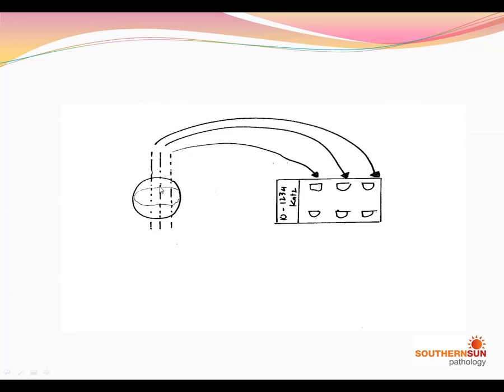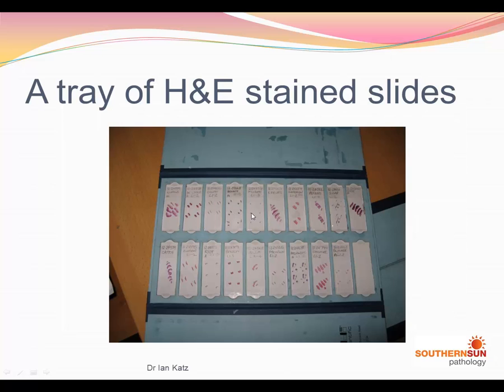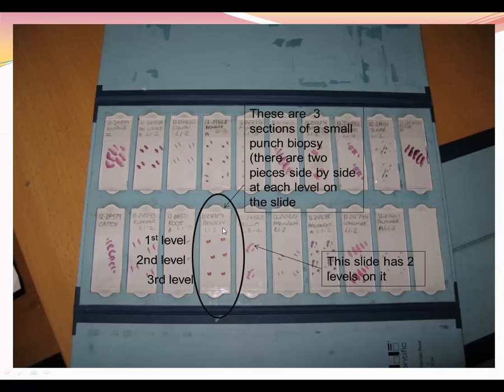This is what a tray of slides looks like once they've been prepared and stained. In this wider example, you can see these are three sections of a punch biopsy, and the first section of an ellipse of skin which has been cut into one, two, three, four, five, six, seven slices of a bread loaf.